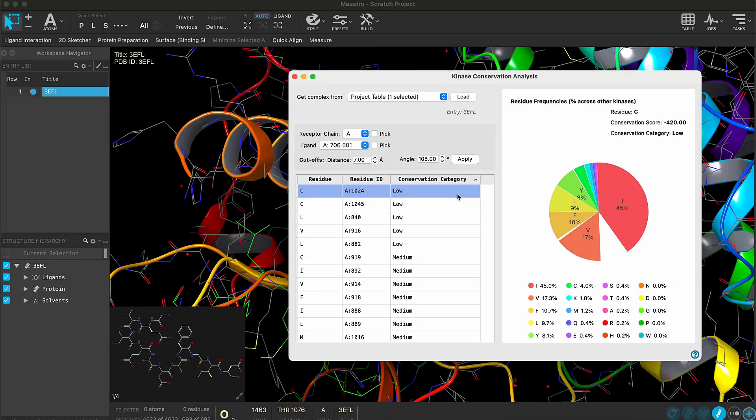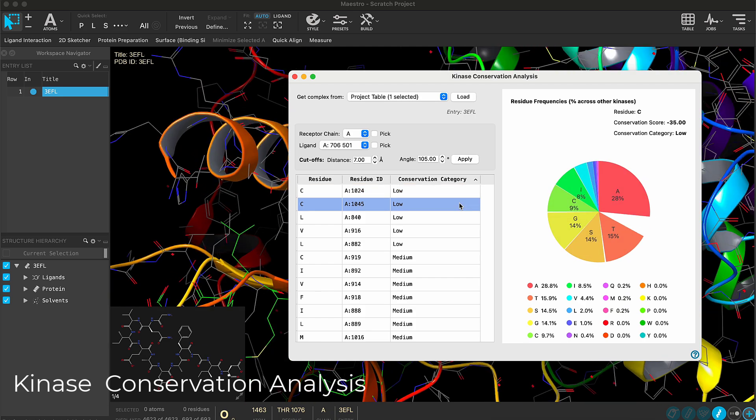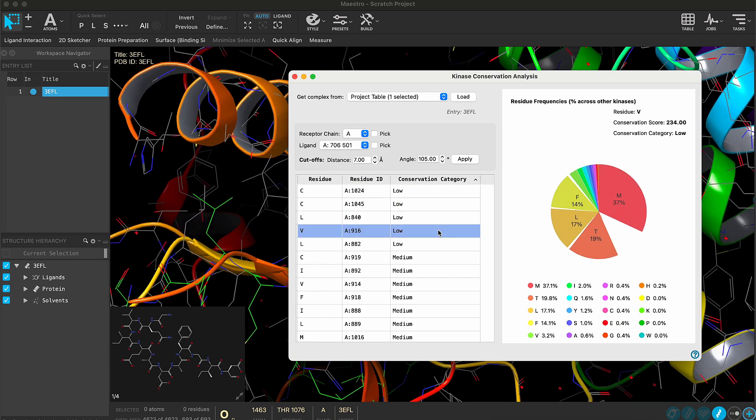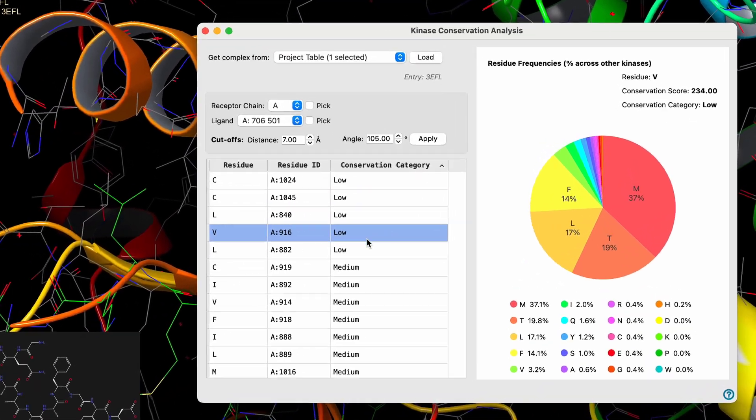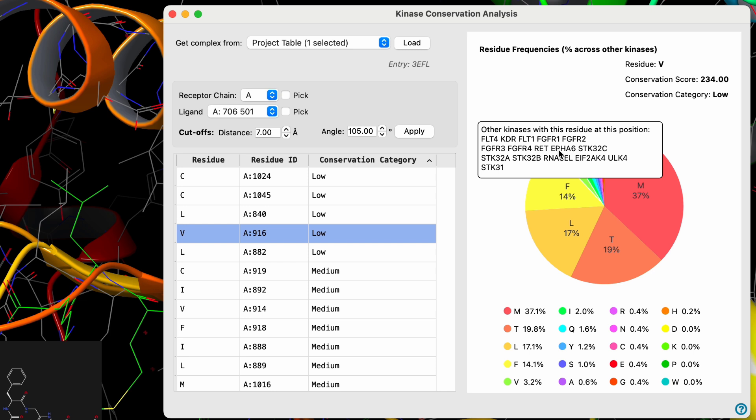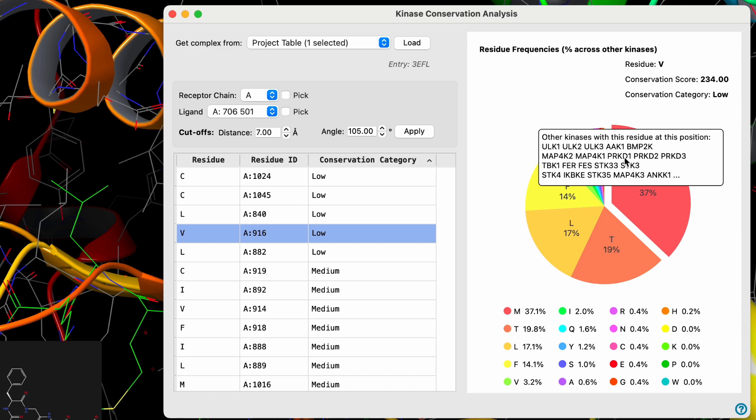New in 2025-1 is the full release of the Kinase Conservation Analysis Panel. Combining sequence and complex structural information, the panel is used to rationalize kinase selectivity challenges, such as identifying promising selectivity handle residues to modulate ligand kinase selectivity, which can then be tested with FEP plus residue scanning.